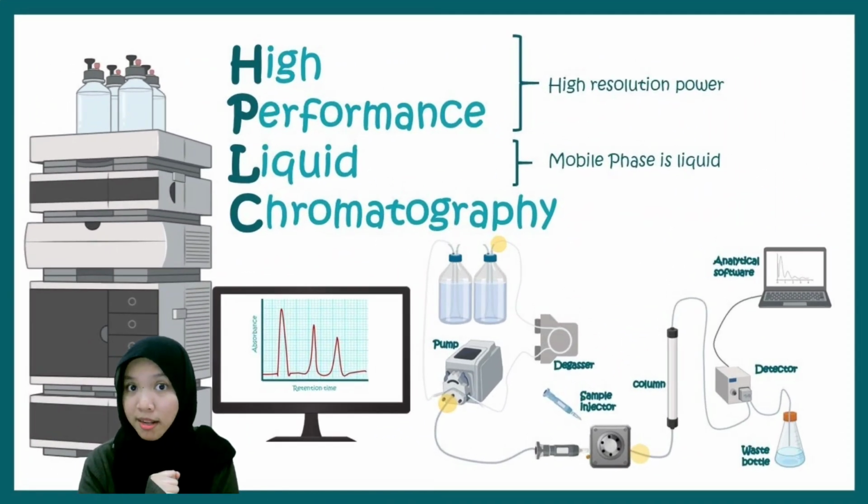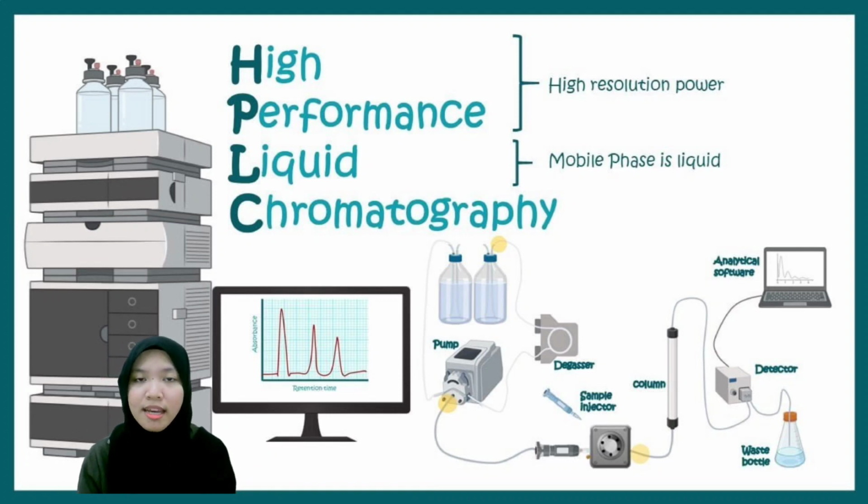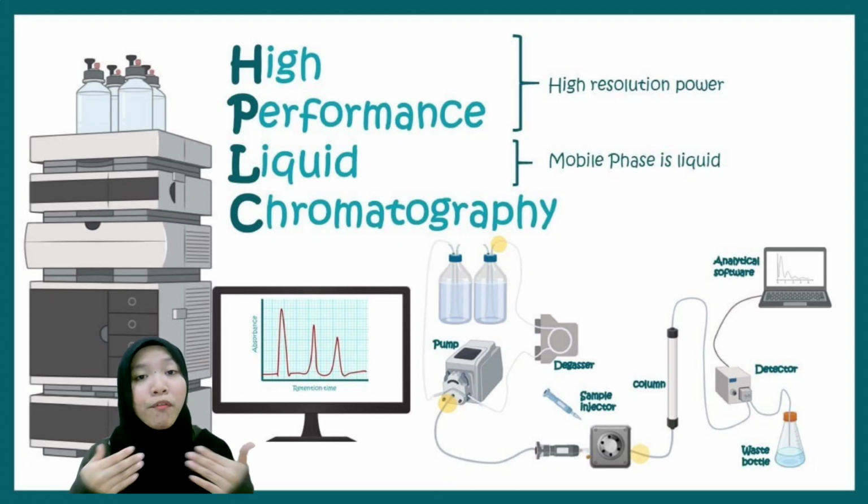So what is HPLC? HPLC is the abbreviation for High Performance Liquid Chromatography, where chromatography is a technique for separation, a chromatogram is the result of chromatography, and a chromatograph is the instrument used to conduct chromatography. HPLC, also known as high pressure liquid chromatography, is the most popular technique in pharmaceutical preparation and measurements due to its simplicity and versatility. HPLC also represents a technique which includes a complete procedure, and this procedure is performed with the aid of a specific device called an HPLC system or HPLC device.